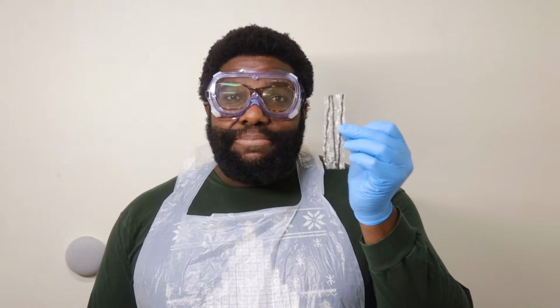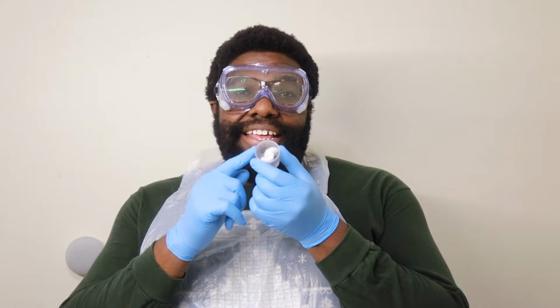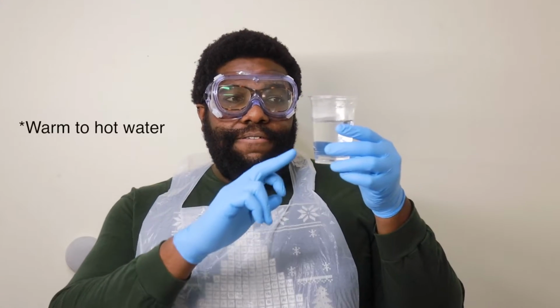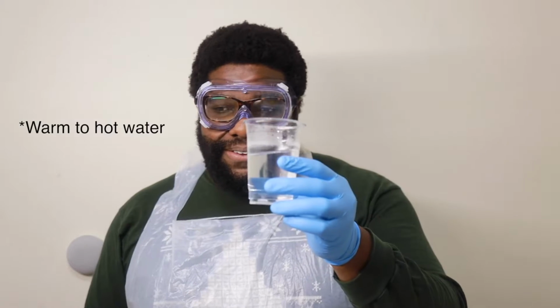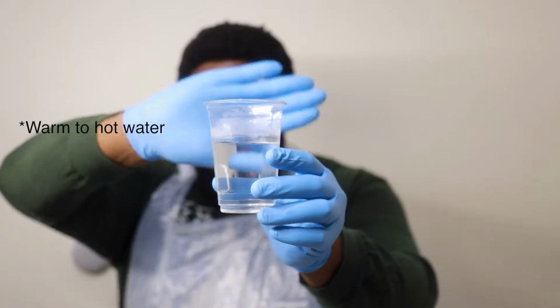Goggles on, apron on, gloves on. Now we're all set for lab. In your lab kit, you should have a dialysis bag, a packet of iodine, a small beaker with a starch peanut inside, it's a packing peanut, a sample of glucose, a pipetter, and a mixer. So I filled a cup 3/4 of the way full with warm water, so you can see some of the steam in the cup, so it's a little hotter than warm.